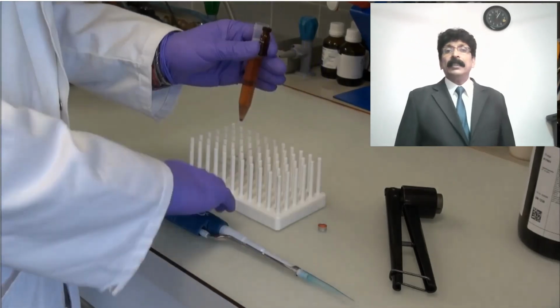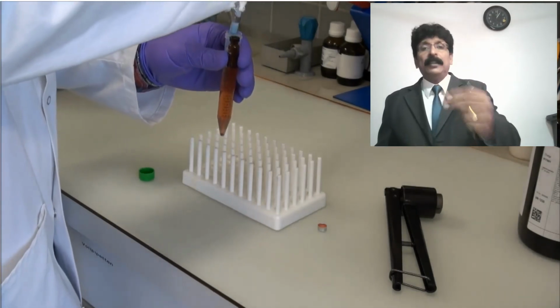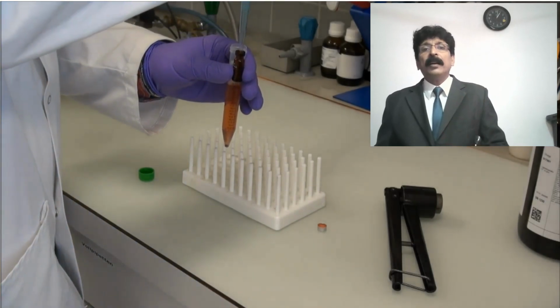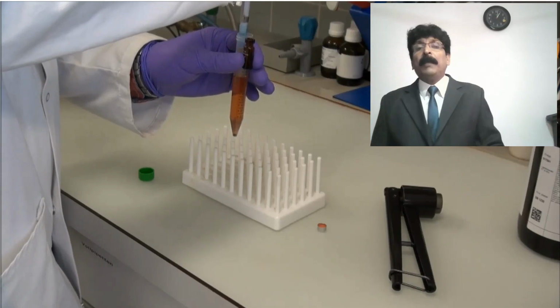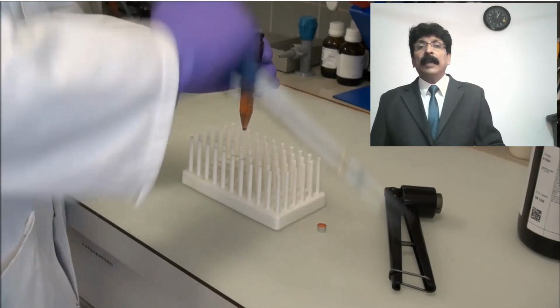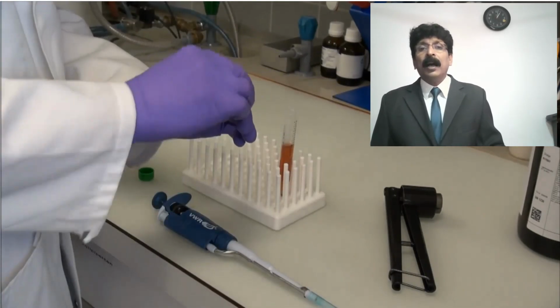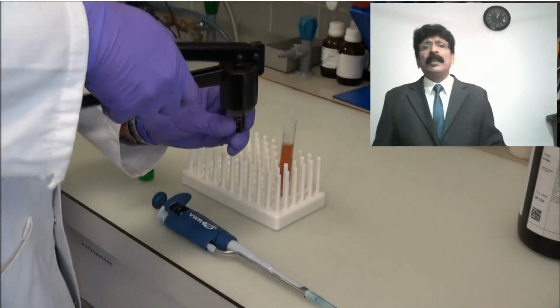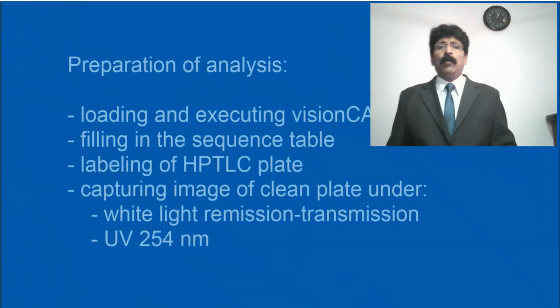See there, she is holding it in one hand, taking the supernatant liquid with the micro pipette, 5 micro ml, and again 5 micro ml, 10 micro ml she is adding, and then she puts the aluminium cap on, and it is sealed by the vial sealing clip. This is the sample, it is ready now.